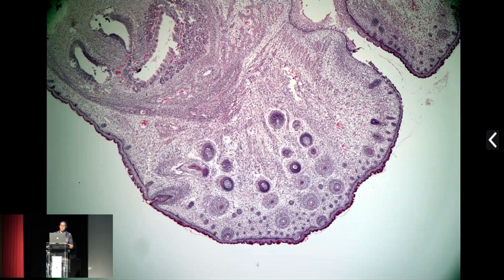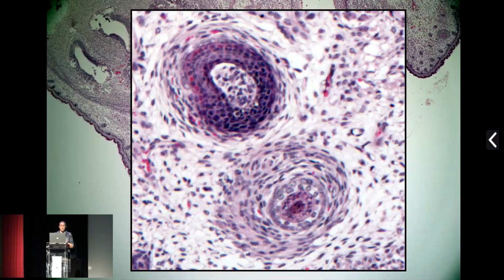So if we now take a region of interest, zoom in just to that region, we can see the vibrissae in more detail. And hopefully you can see, if we've got adequate contrast and resolution, the individual chromatin granules present within the cell nuclei. And that's the resolution that we have across that entire field of view.